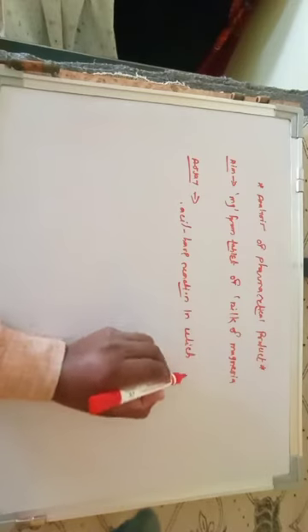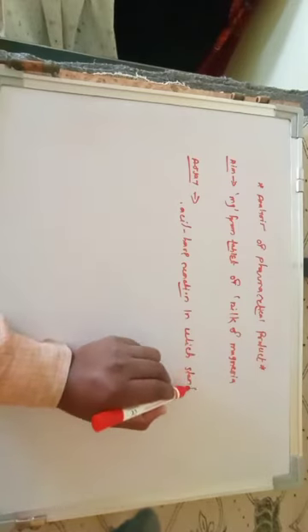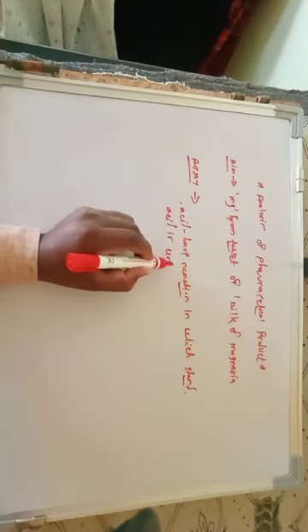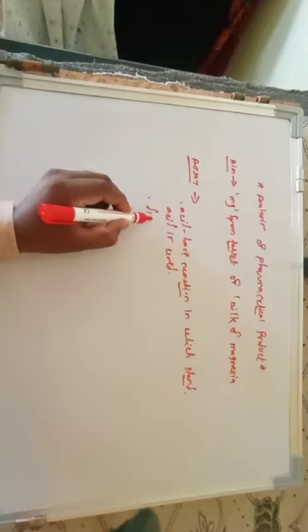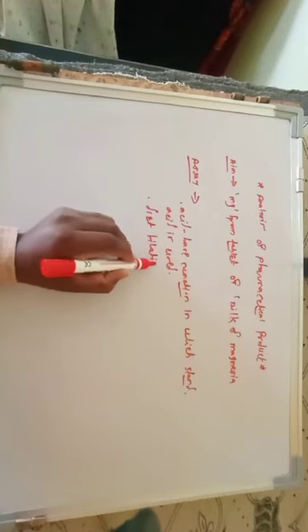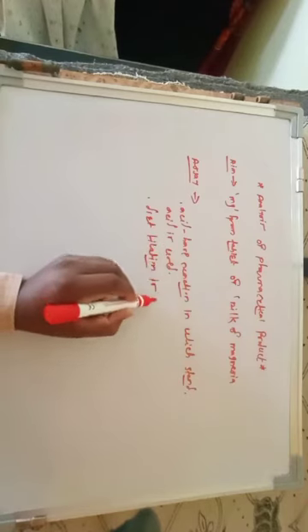We already discussed that it is insoluble in water, and therefore direct titration with acid is not possible.